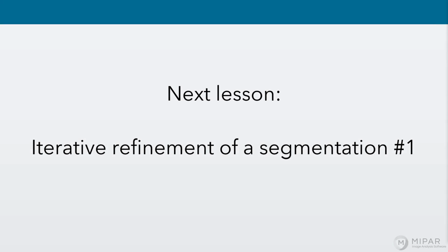So today's lesson was a little bit shorter, but we talked about some very powerful techniques. Grayscale Reconstruction first, and then two-stage segmentation. That two-stage segmentation really can unlock the ability to automatically segment some pretty difficult or some pretty complicated features in your images. So I very much encourage you to try to get that sort of thinking, that iterative thinking under your belt.